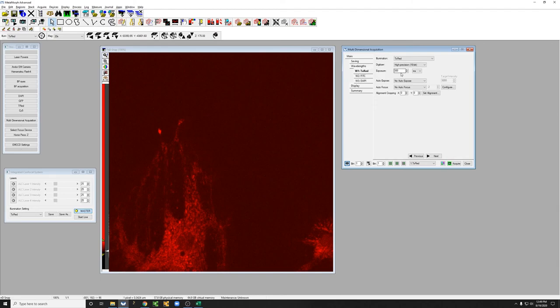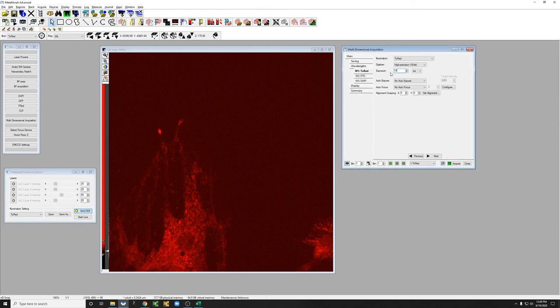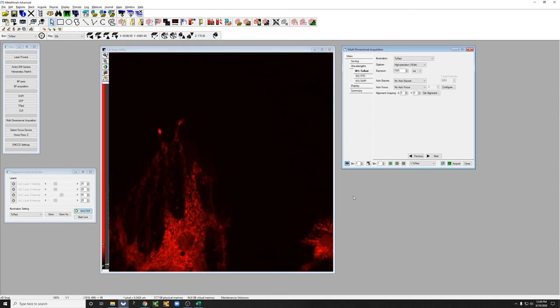So in this case, let's set this at 50% and set this to a one-second exposure. Here we get a high-quality image.